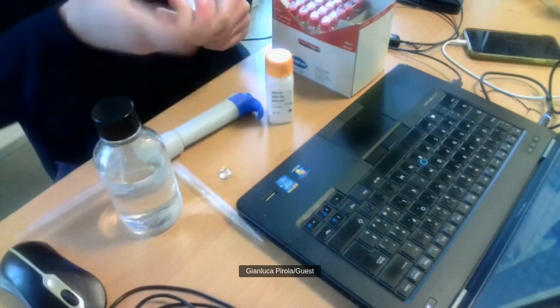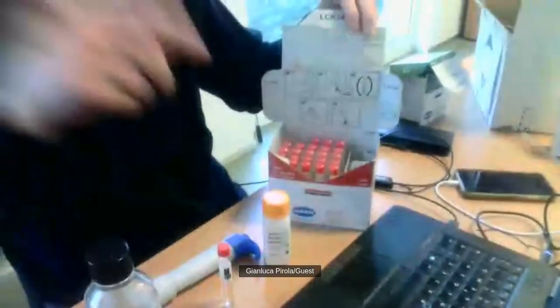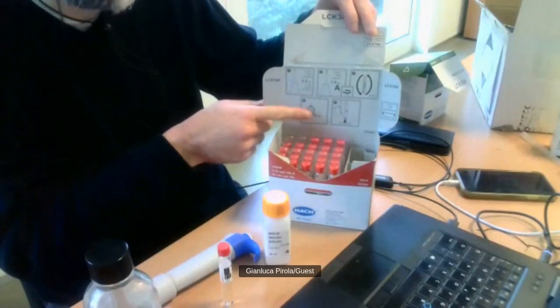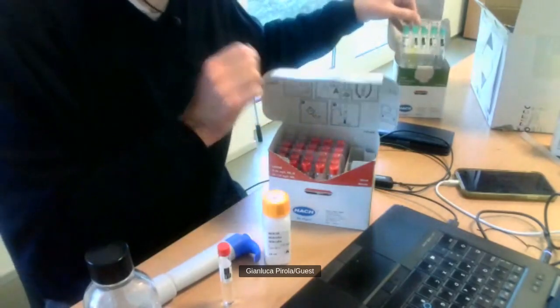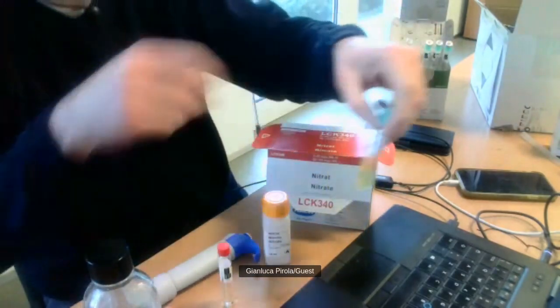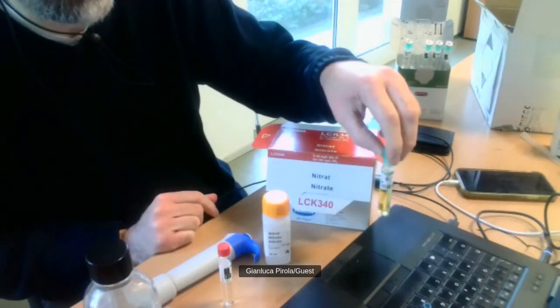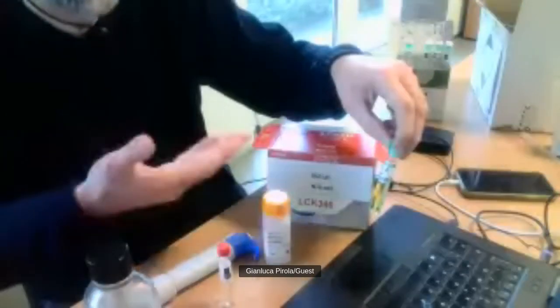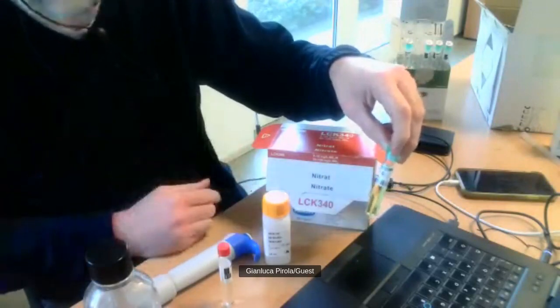Then invert 2 or 3 times, and even in this case, wait 15 minutes. We have to wait 15 minutes until the reaction is complete. Maybe you can see that the color has slightly changed. This is the cuvette test of ammonia we used before. It's becoming more intense because the reaction is going on. And when we reach the time of 15 minutes, the reaction will be complete.